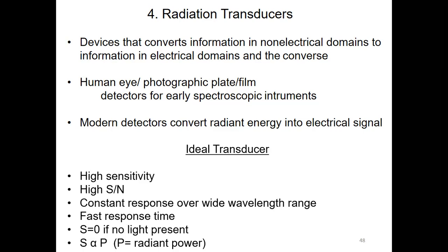Then we can get a good signal, or we can get good information about the sample. Okay, those are the main characteristics that an ideal transducer should have.